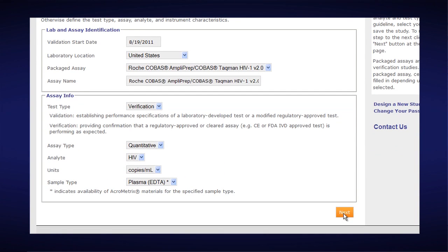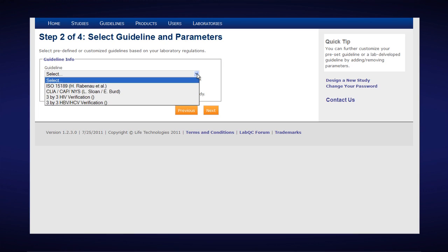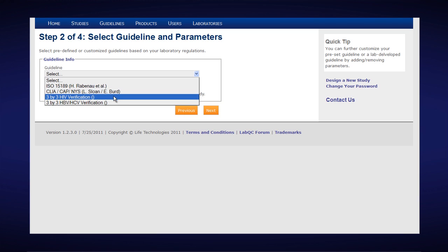Now we'll click on the orange Next button and choose the guidelines to apply. In this case we'll choose the CLIA CAP New York State guidelines because we're in the United States. But you could also choose in this case the 3x3 HIV verification. ISO 15189 guideline is also available.